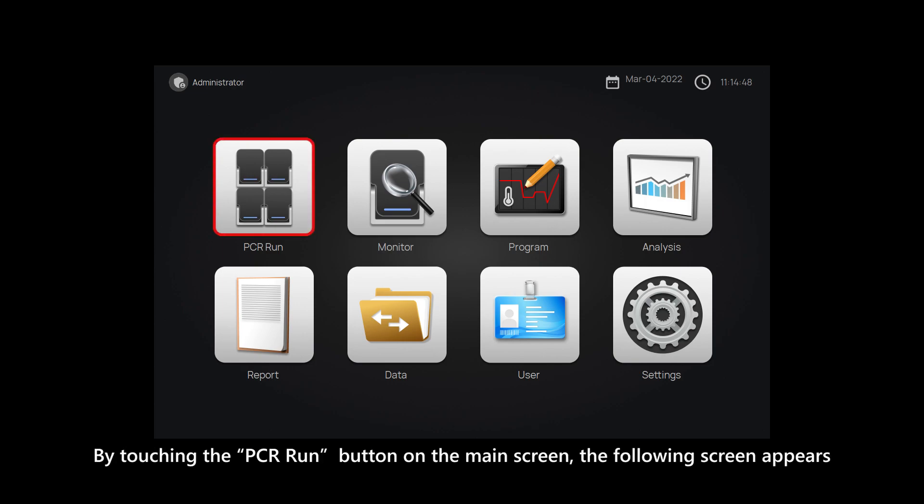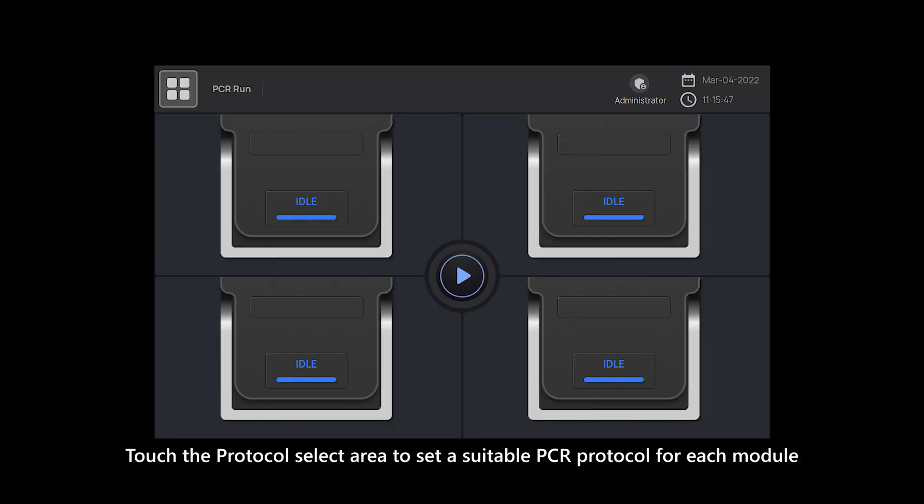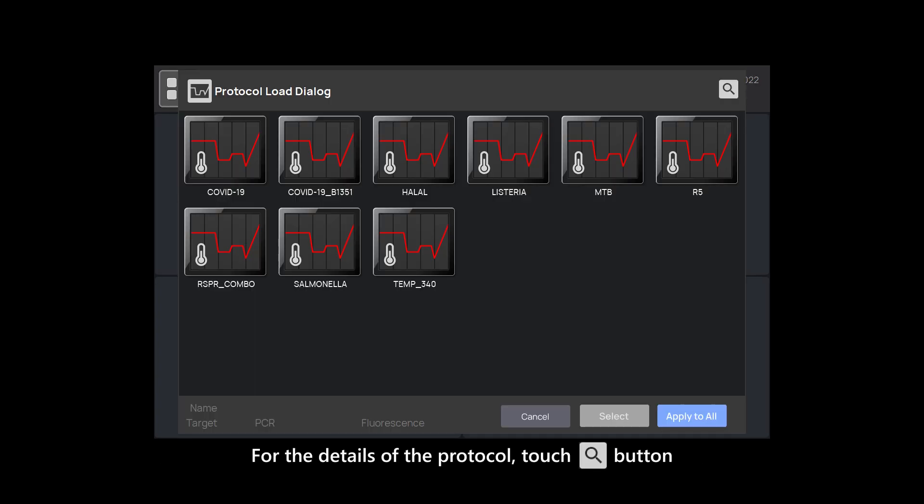By touching the PCR run button on the main screen, the following screen appears. Touch the protocol select area to set a suitable PCR protocol for each module. For the details of the protocol, touch the details button.